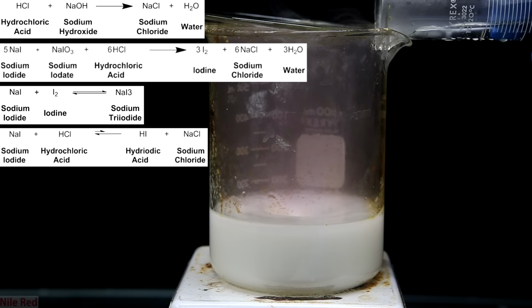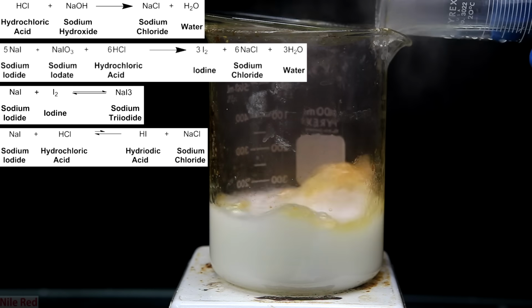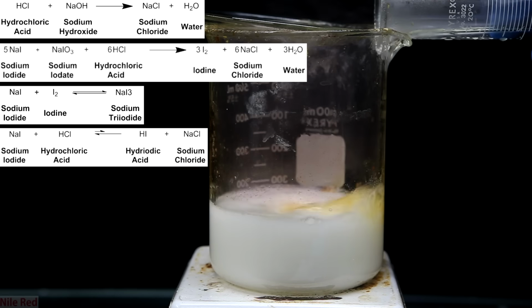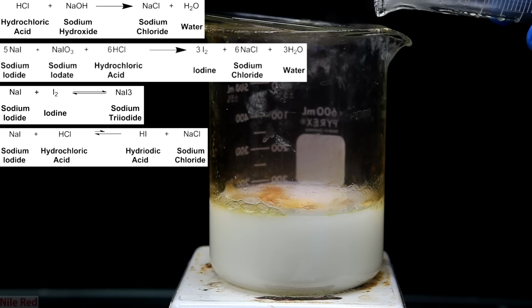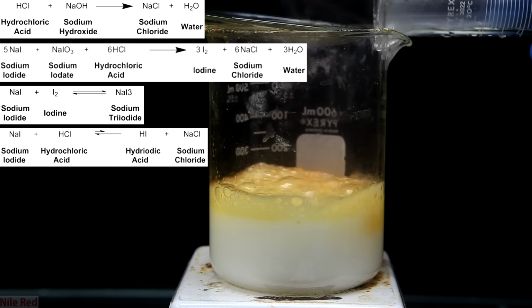As the solution started to heat up again as more hydrochloric acid was added, the splashing got worse. To remedy this, I simply just put a watch glass on top to block anything that might have splashed out. Of course, we could go the route of actually cooling everything in an ice bath and then adding everything slowly, but I didn't really want to do this.